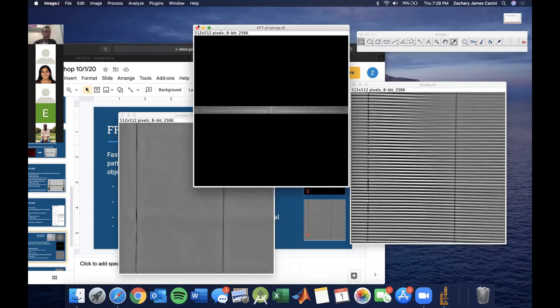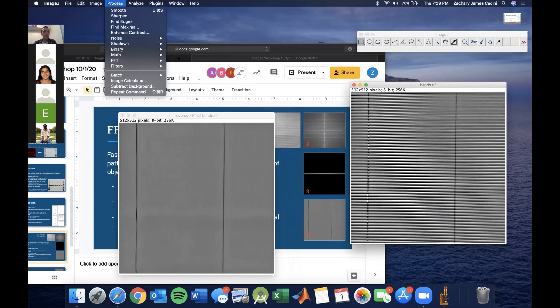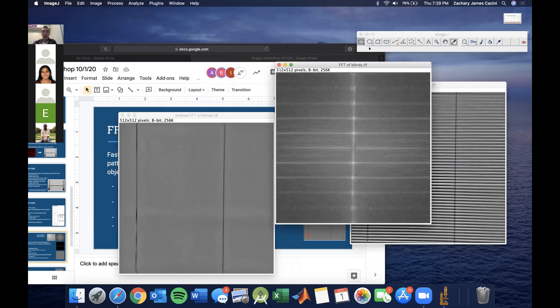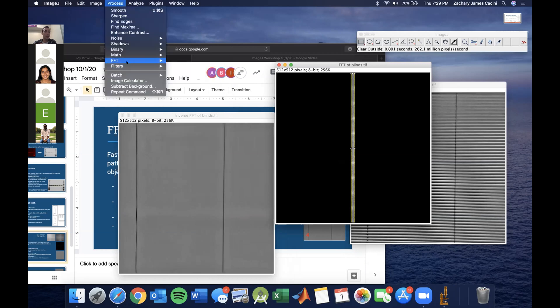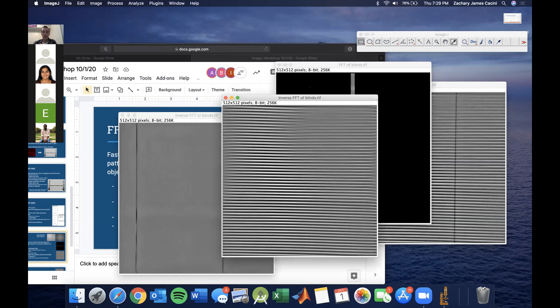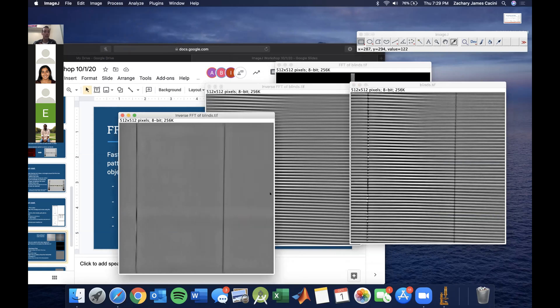We get rid of this picture and then do it again to extract only the horizontal pattern. So FFT > FFT, then use the rectangle selector on just the vertical line, Edit > Clear Outside, and then Process > FFT > Inverse FFT. Here, as you can see, this has only the horizontal patterns. It has subtracted the two vertical lines, and they've been separated in both of these two pictures.